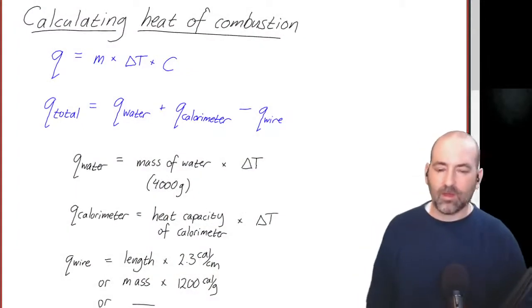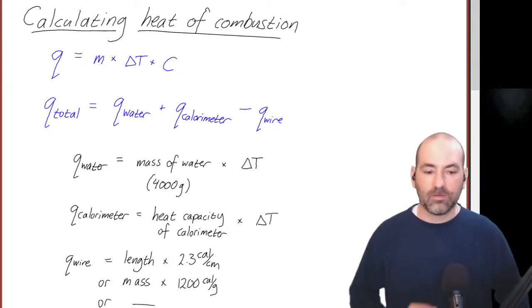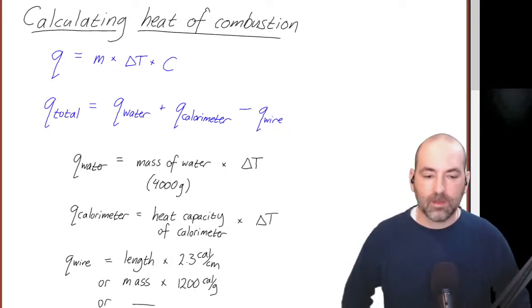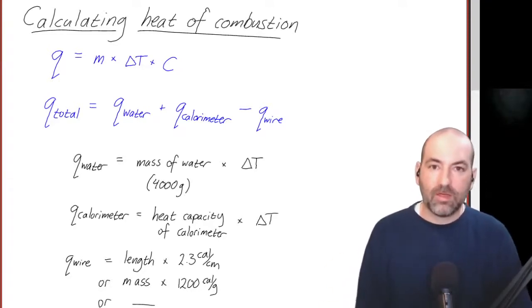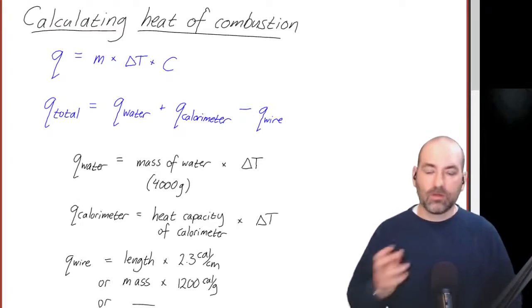Morning. All right, so today for Chem 103, we're going to go through the calculations for the biodiesel project. So now you should all have your data at this point, and we're going to take a look at what types of things you need to do to actually make all of that data meaningful. The GCMS data, we're going to go through that today also.